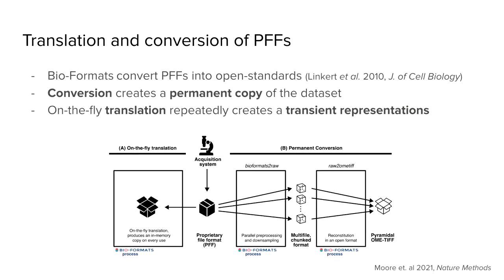The other method for dealing with interoperability is found in the form of on-the-fly translation, and that's shown here on the left. What that connotes is that Bio-Formats is a persistent process which can be used in applications to repeatedly create transient interoperable representations of the data. And so as you can see, Bio-Formats has a lot that it takes on in order to accomplish this compatibility layer. And on-the-fly translation is this active process for some applications like OMERO for keeping these data interoperable with various tools.